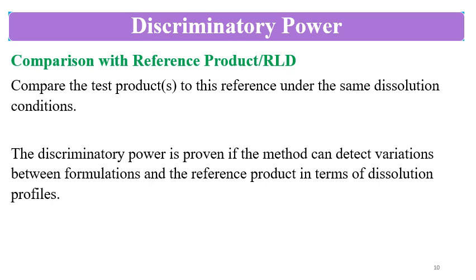that you should compare the bioequivalent batches with the mismanufactured batches, and also check whether your specification time points are specific enough to detect those changes in the percent release or percent drug dissolved between the different batches.